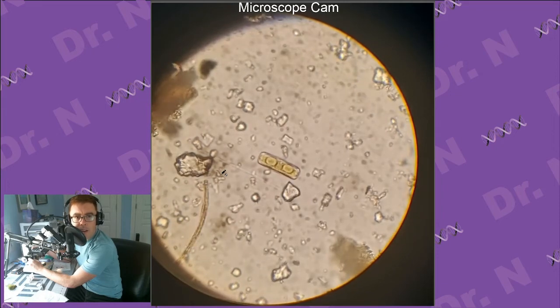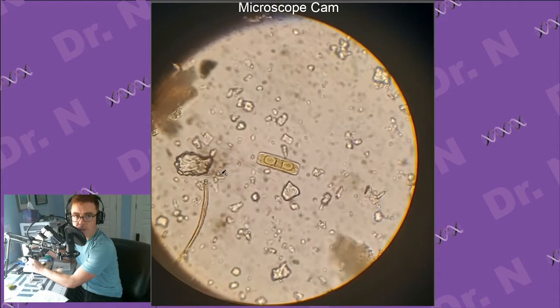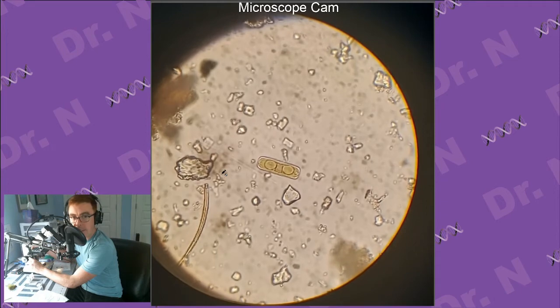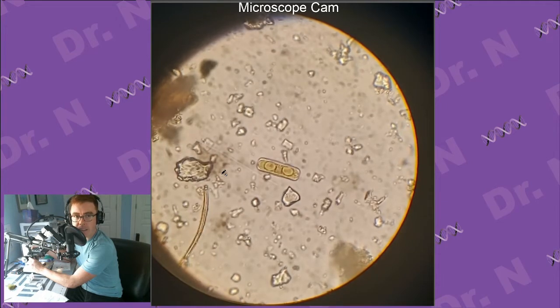And speaking of which, so those guys right there, I just know that won't be affected by my stain, but those two center things, I doubt those could be the nuclei, but plant cells often have something called a central vacuole, which is a large, basically sac on the inside of them that they use to store materials, usually like starches, things like that. And often you can see them very easily. So I'm kind of guessing that's what those are.